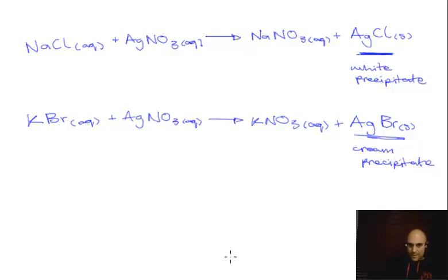Okay, now let's try an iodide. This time, why don't we try a different iodide altogether? Let's try calcium iodide. Now this has a slightly different formula because calcium's in group 2, iodine's in group 7.